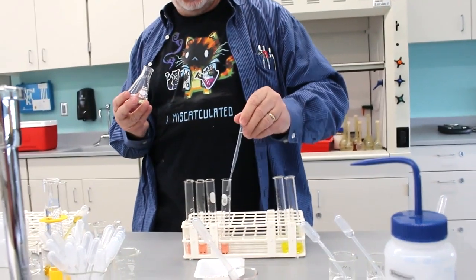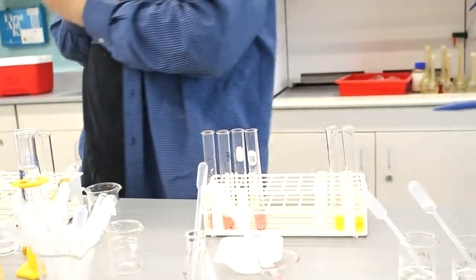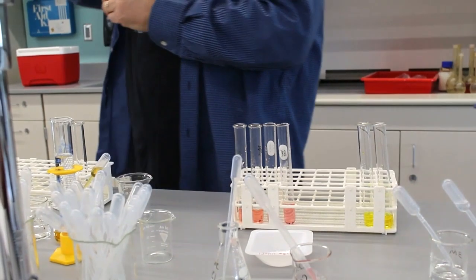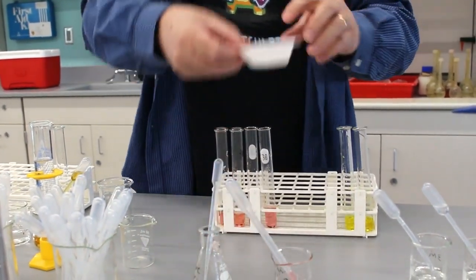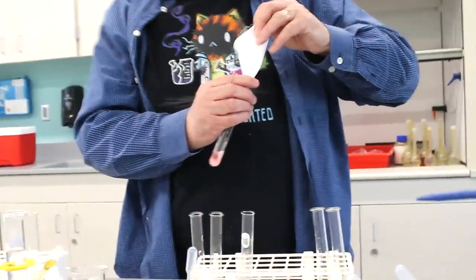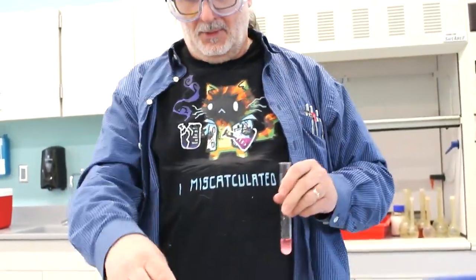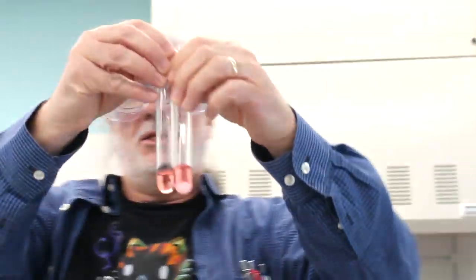It says add HCl there. I don't see anything happening. Still looks pink. And then to the second test tube, add about 1.5 grams of NH4Cl, ammonium chloride, which I've already conveniently measured out. It looks pink to me. But look at the control. Doesn't it look a little different colored pink?